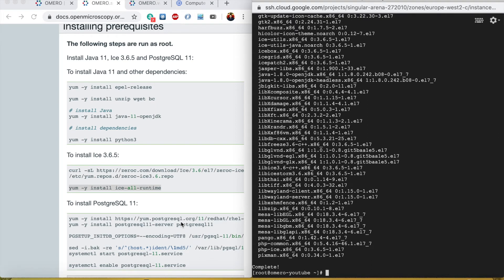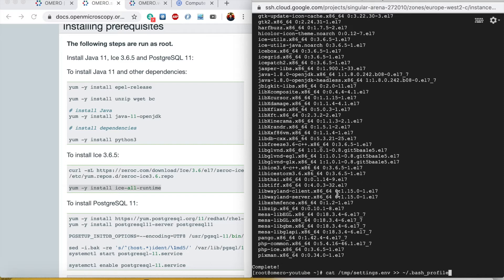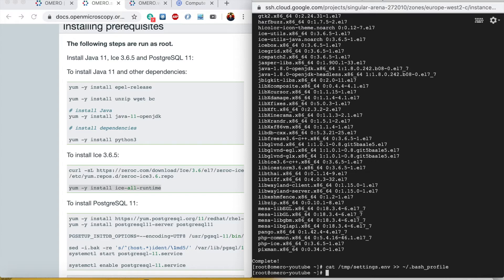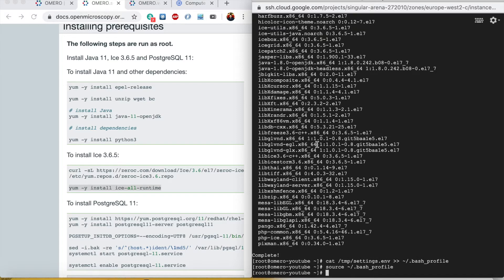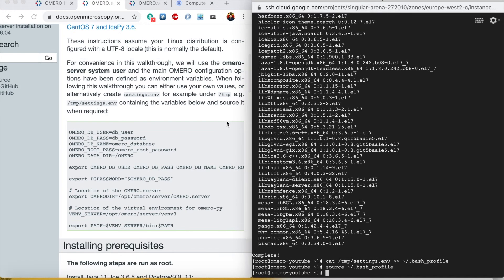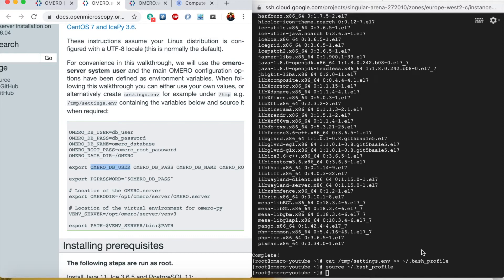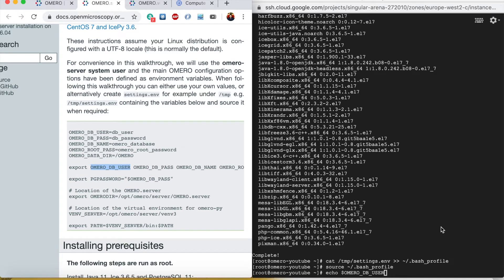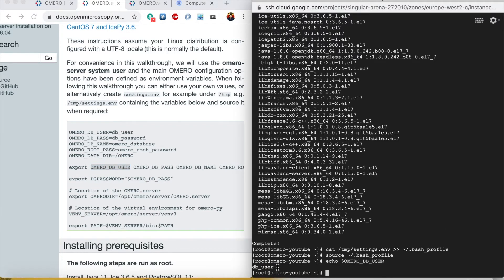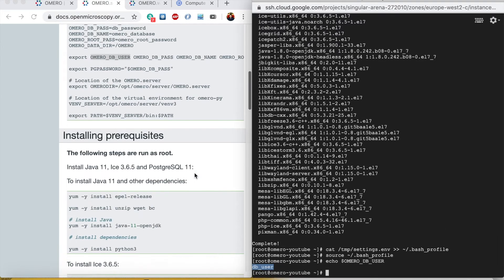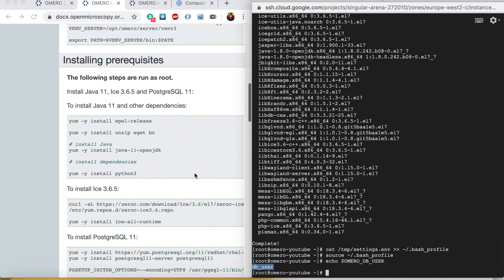It's done. Now I will apply all the environment variables that we saved in /tmp/settings.env into the bash_profile and I will do source .bash_profile. To confirm that the environment variables are set properly, I will do echo $OMERO_DB_USER, so it should be db_user. You can see that I got it so the environment variables are working fine.